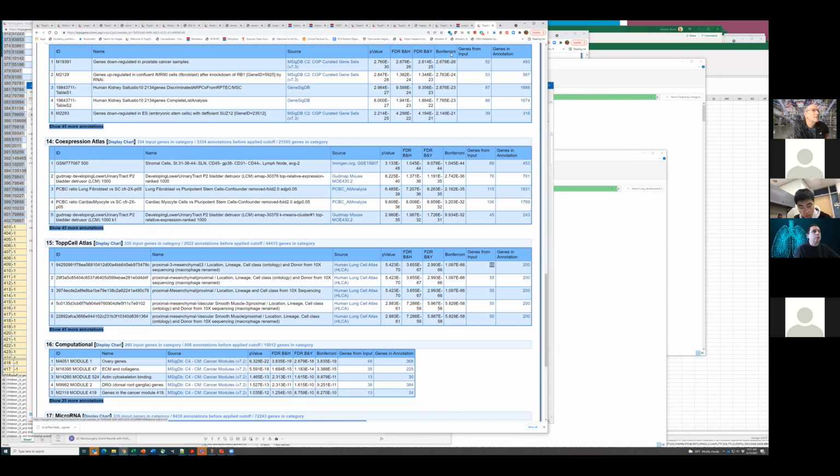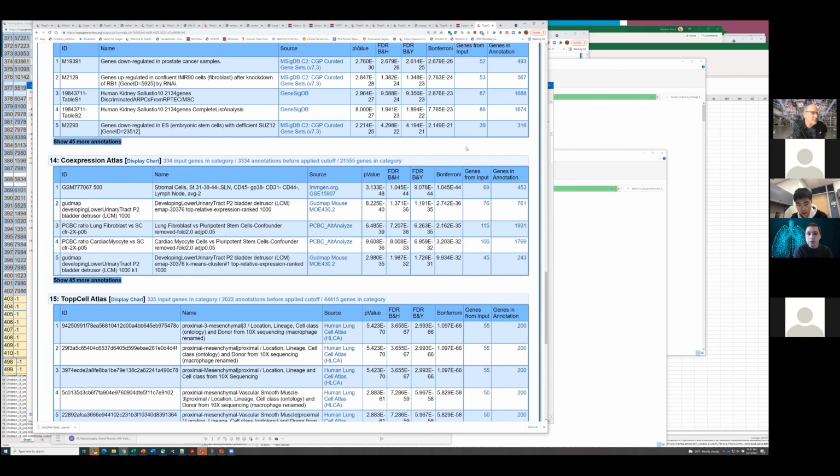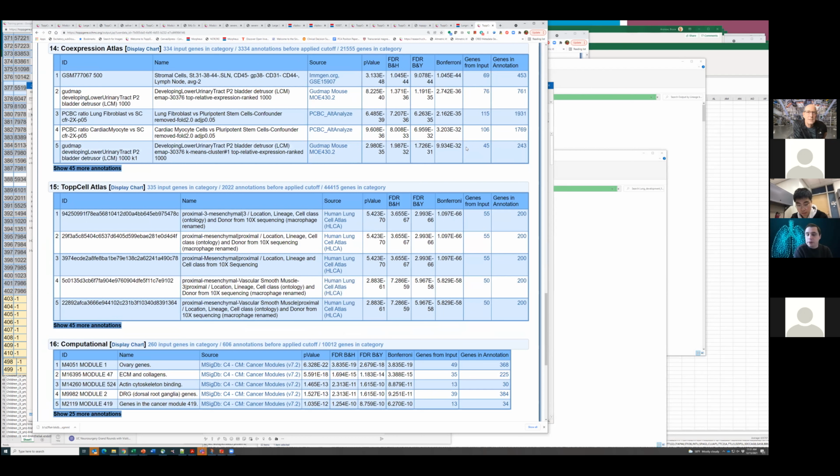Oh yeah, I was more wondering, can you interrogate a proteomics data set from COVID? No, I don't have any. Do you have any? Yeah, that's what I was saying. We will have some, but there are some online that could be leveraged already. Oh, fantastic. Yes, even Luminex as well as actual mass spec-based proteomics. I would love that actually if you could point it out.